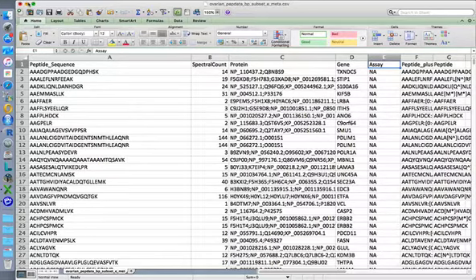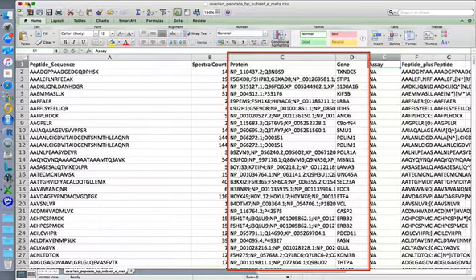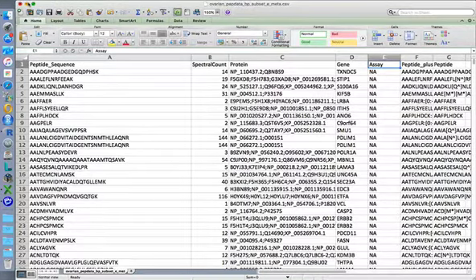There should be at least one additional column in the metadata information file that contains a mapping of the expression data biomolecule identifier to another identifier. In our case, there is a column for peptide, and there are also columns for protein and gene that give the proteins or genes that each peptide maps to. If quantitation from peptides to either proteins or genes is desired, the metadata information file must be uploaded and contain a mapping from peptides to either proteins or genes.